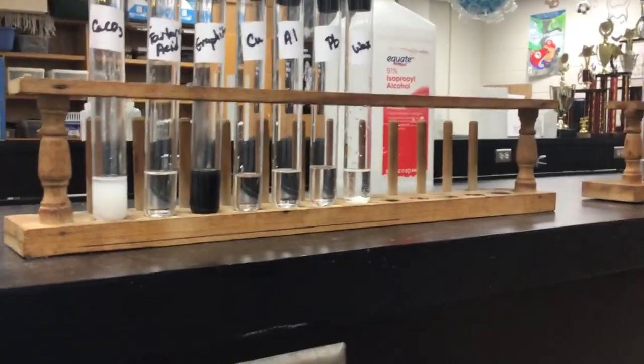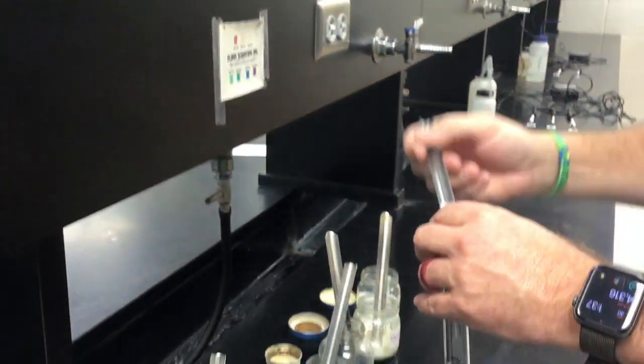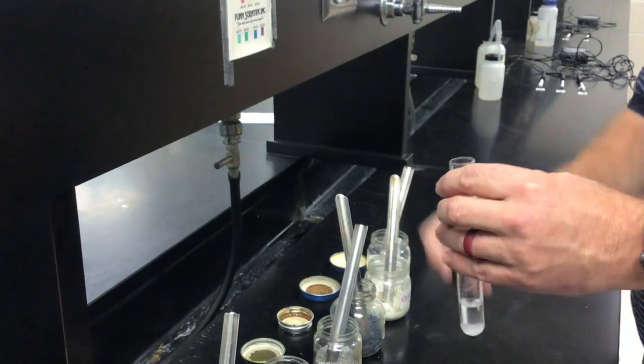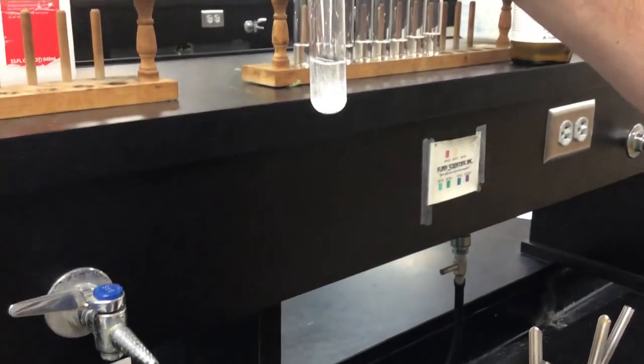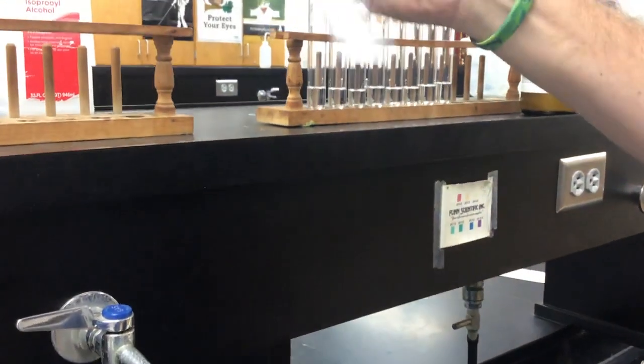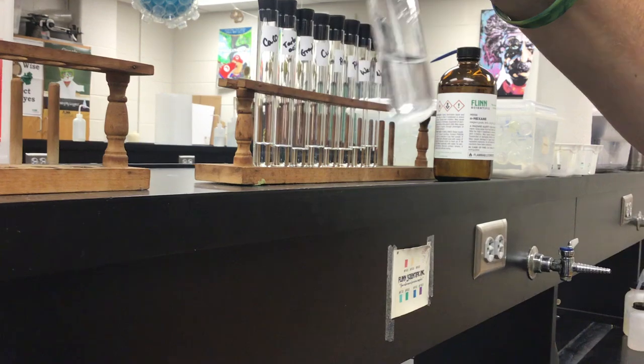And then NaCl. A little bit of salt here. Place the salt in there. It's quite a bit of salt actually. That's okay. Quantifying our salt would have been a good idea, but that's okay. So we're putting the salt in there and see if it's dissolving.